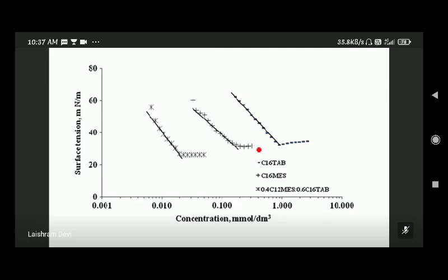Here a comparison of 3 surfactants is shown, just a sample graph which I took from Google images. You just have to plot one graph because you'll be provided with just one specific detergent. You will see a gradual decrease from one portion to another, because you're plotting surface tension versus concentration. Then after a particular concentration, you will see that your graph is showing a horizontal line.